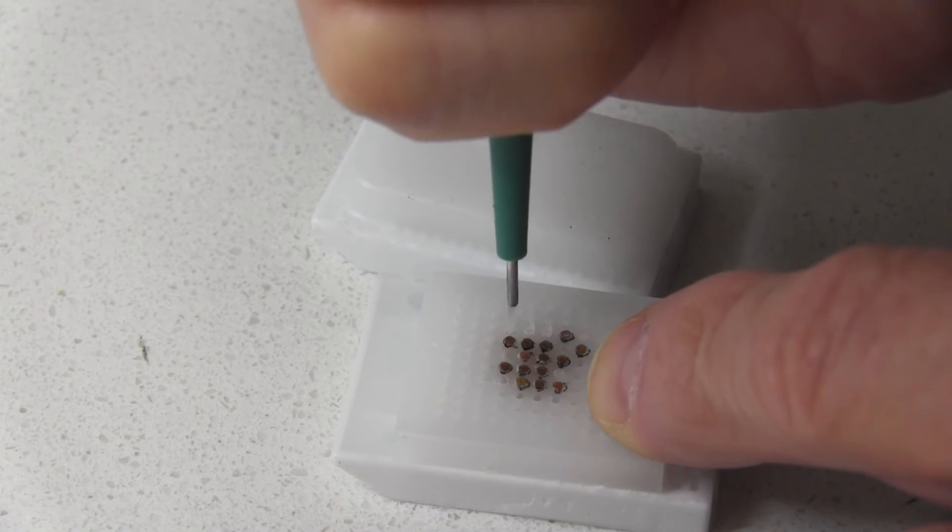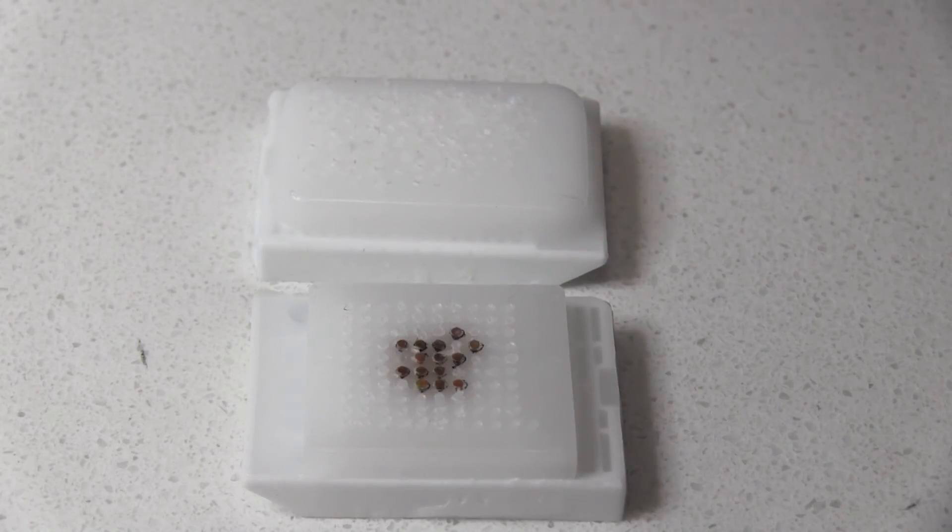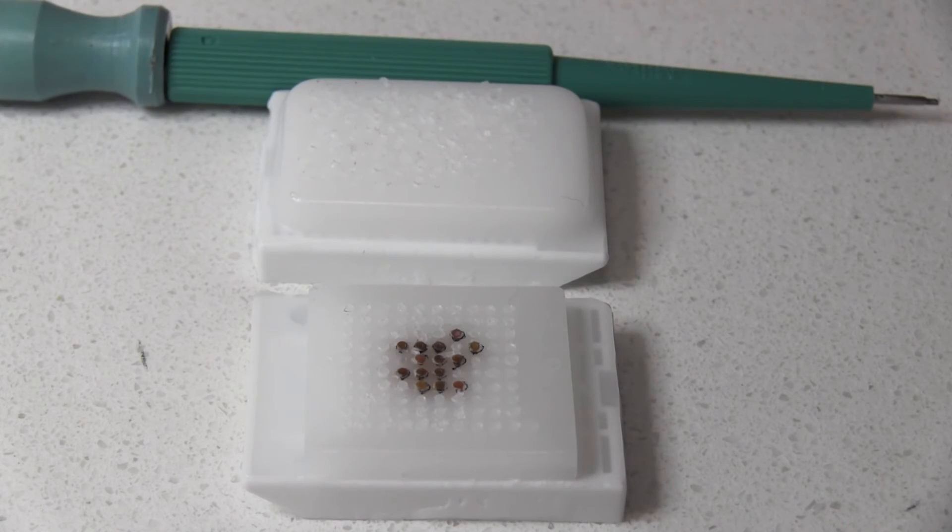If you want to do the blank paraffin cores first and then tackle the tissue cores later you can. This is a good way of getting practice before you start doing your main cores.